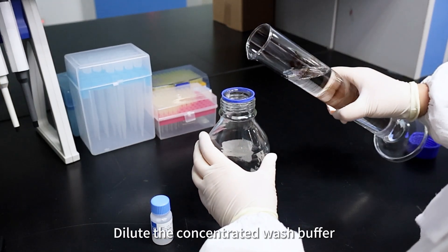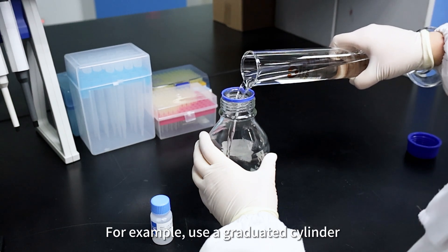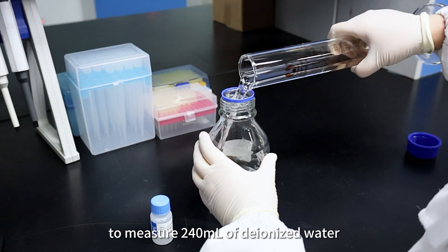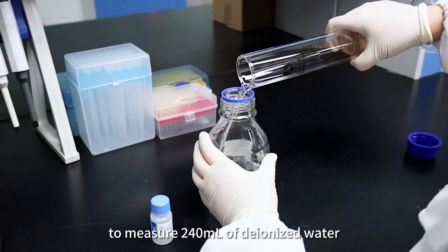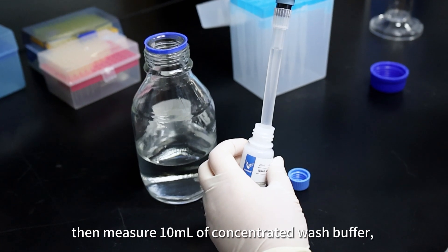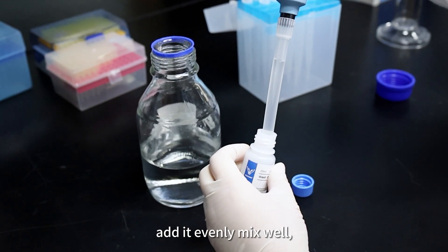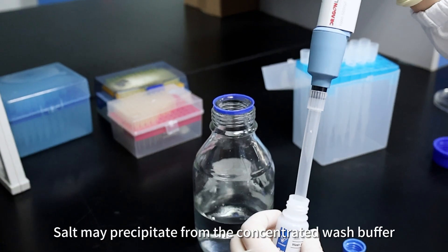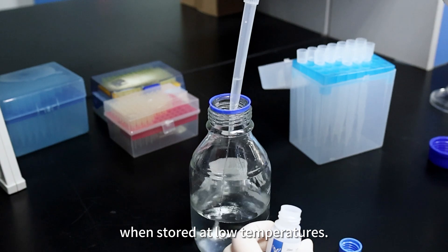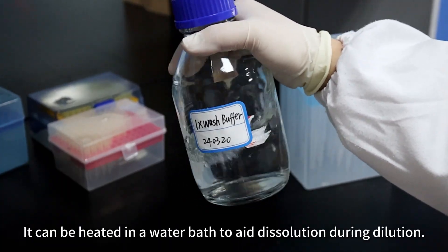Dilute the concentrated wash buffer at a 1:25 ratio with deionized water. For example, use a graduated cylinder to measure 240 milliliters of deionized water and pour it into a beaker or other clean container. Then measure 10 milliliters of concentrated wash buffer, add it, mix well, and prepare before use. Note: salt may precipitate from the concentrated wash buffer when stored at low temperatures; it can be heated in a water bath to aid dissolution during dilution.